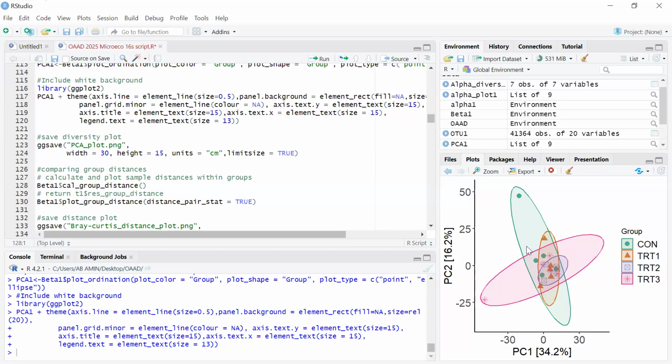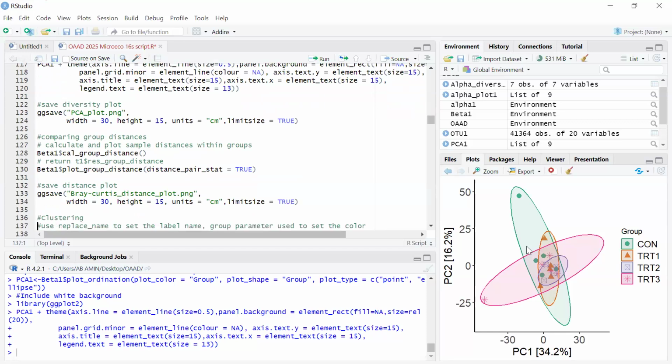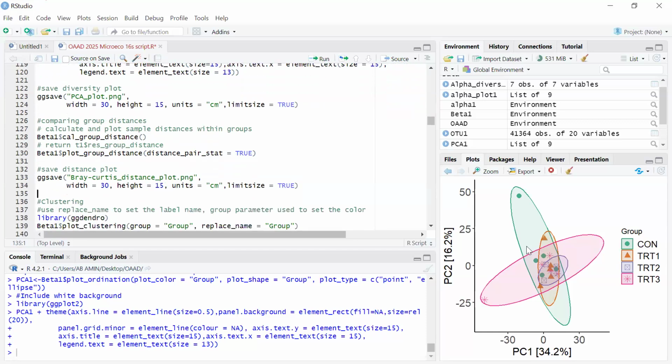Yeah, I think we can move on. I think it's clear. Although he's saying that everything is similar, actually the percentages for PC1 and PC2 are different between that of the PCoA and the PCA. So definitely it indicates that there are differences in calculating the PCoA and PCA.